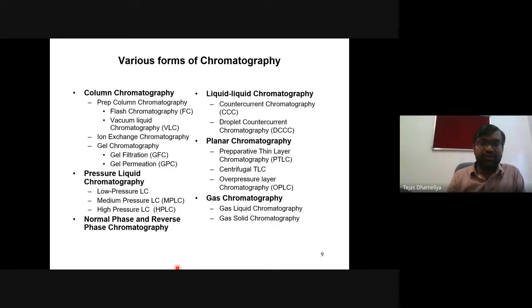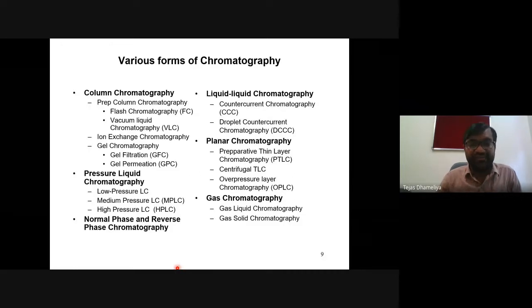Okay, so let us go into depth of this column chromatography. Naturally there is a particular kind of column. When we cover column chromatography, I shall show those videos also through these online notes, where I will show you how the column chromatograph looks.